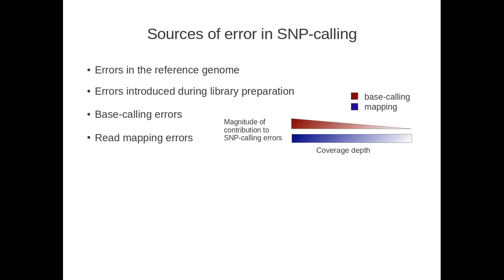But if you have 100 reads, and you only have, say, 5 with an error at a particular position, because you had a 5% error rate, then those errant reads are going to be at such low depth at that position that these genotype likelihood models, these mathematical models that infer the genotype, are usually not going to get it wrong. So you're unlikely at high coverage to suffer from these base calling error problems.